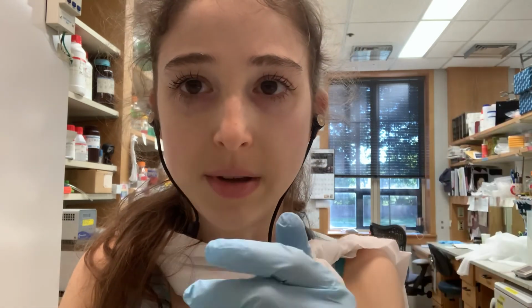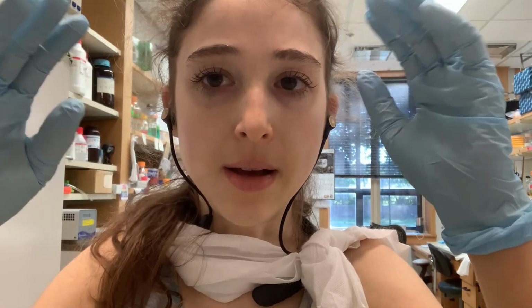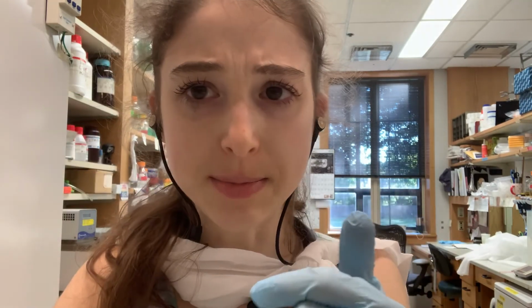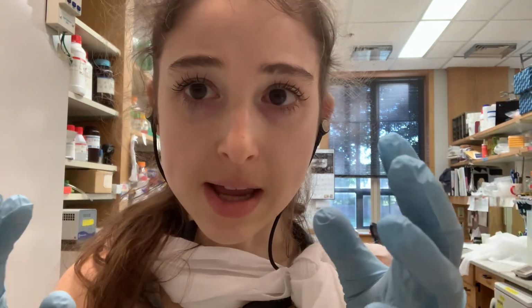So I'll talk a little bit about the background. Starting with recombinant expression, just a really brief overview, and then different types of mutations, how we name these, and then how we make them.